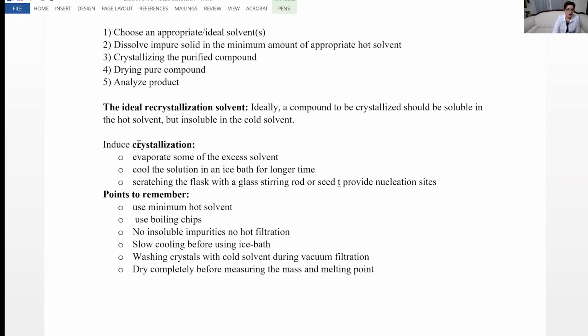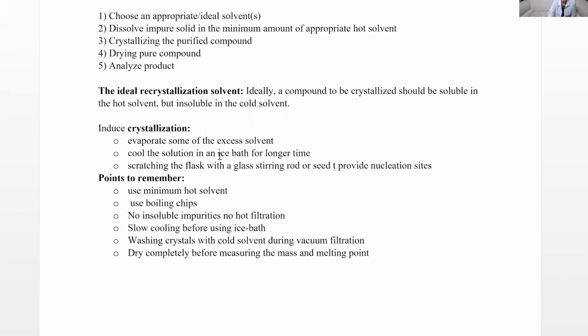So you have to make sure to get the excess solvent evaporated to get a saturated solution, then you cool it down, and you will get the crystals. Cool the solution in an ice bath for a longer time. Solubility is directly proportional to temperature. The higher the temperature, the higher the solubility. So if you lower the temperature, the solubility would be low. That means more crystals are going to form, or the crystals will start forming.